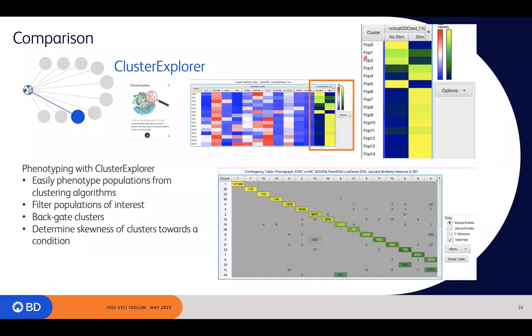But again, unless you annotate the data, this is not going to be useful to you in the end, because you can't modify the table without those designations.